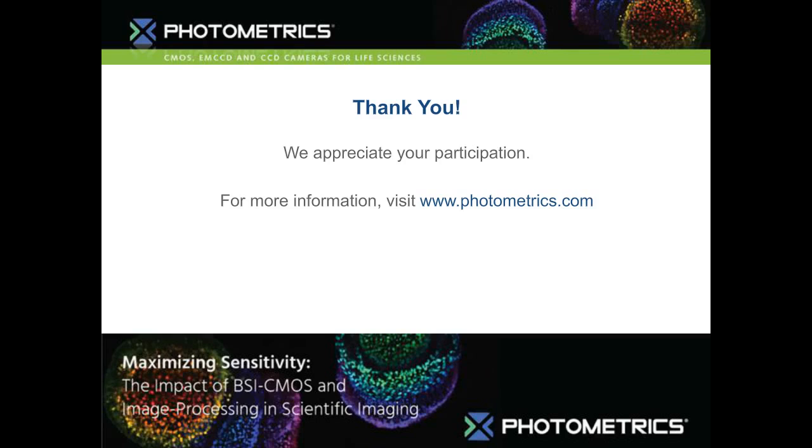So yes, you do get more dynamic range out of it, but as you mentioned, it won't affect the noise of that pixel. That will really come down to the design of that specific pixel.